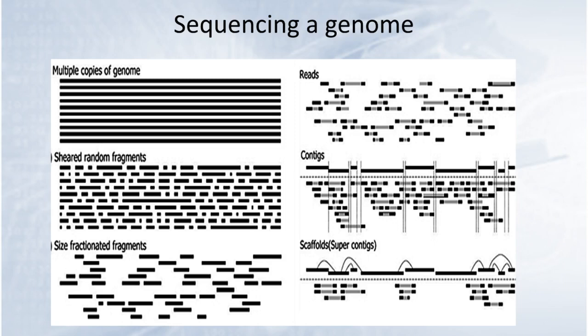And so, as I told you in an earlier video, we're using a transposase-mediated fragmentation combined with inserting the adapters for Illumina sequencing into your sequence at the same time. And it generates a set of overlapping fragments. So each part of the genome is presumably represented in this library that we're going to sequence by many fragments that originated from different copies of the original genome and have different ends on them.